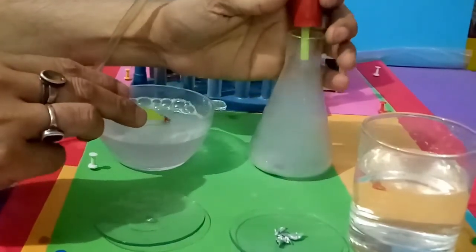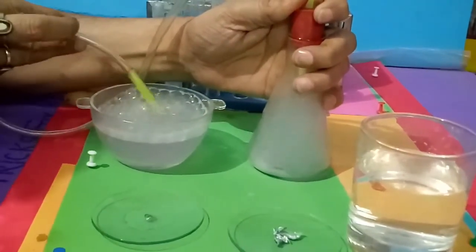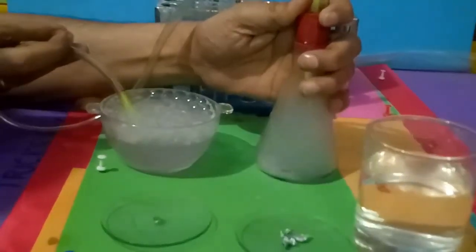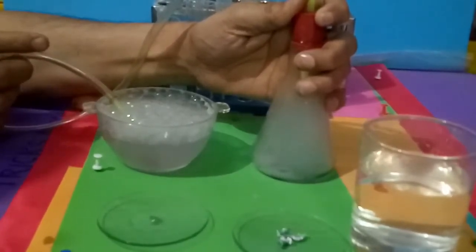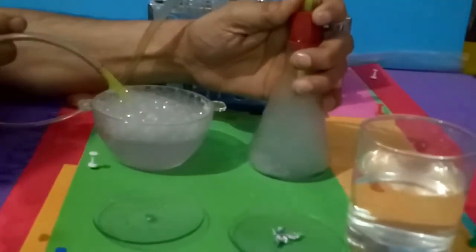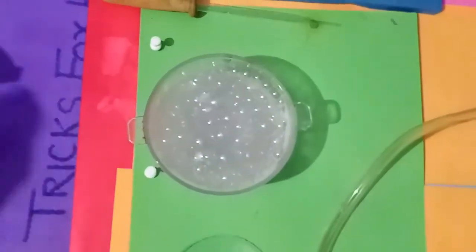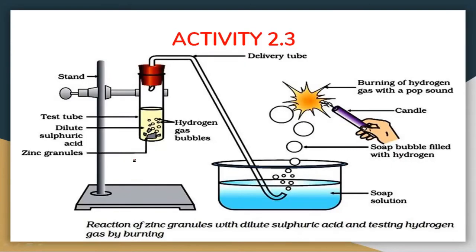Here you can see in the soap solution, a large amount of air bubbles are formed. These air bubbles are of a colorless gas. Let's see which type of colorless gas it is. For this, we are going to do a confirmatory test — we are going to take a burning matchstick near it and see what happens. The gases explode with a pop sound.